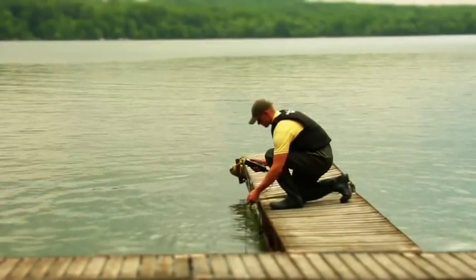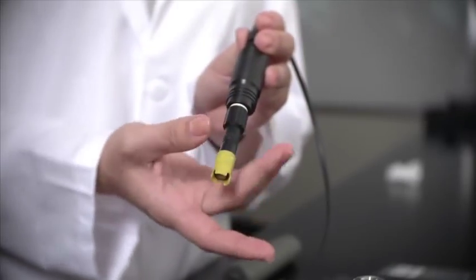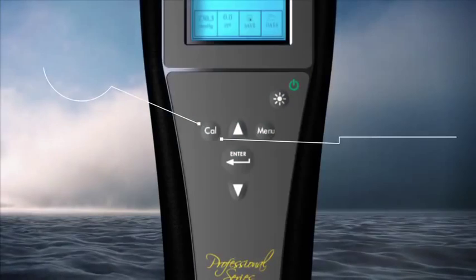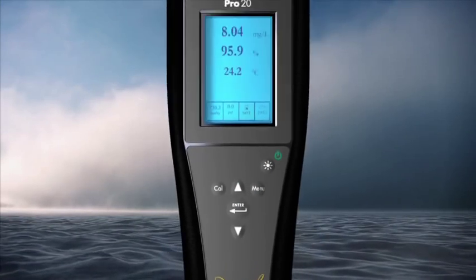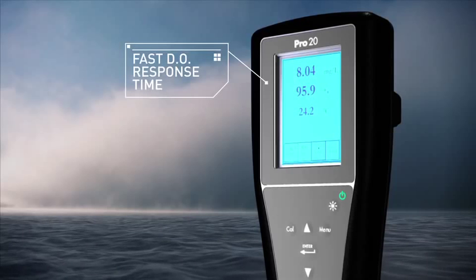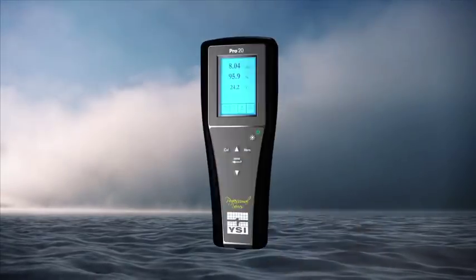The Pro 20 has additional features that include your choice of field DO sensors — Polar Graphic or Galvanic — or a lab BOD probe, an internal barometer for highest accuracy data, and a one-touch CAL function that calibrates DO within 3 seconds with a push of a button. It also features a backlit display and glow-in-the-dark keypad, and the fastest DO response time on the market — 95% of the reading in a stunning 8 seconds with standard membrane.